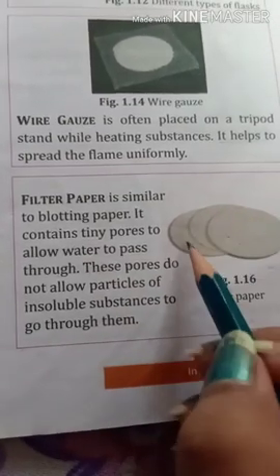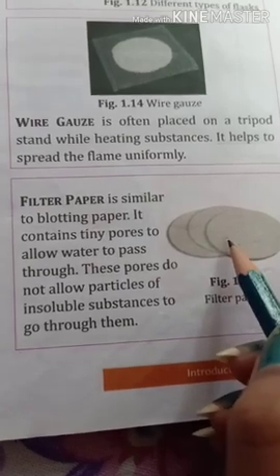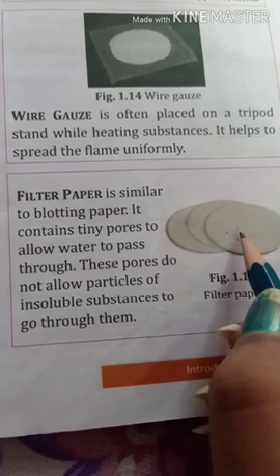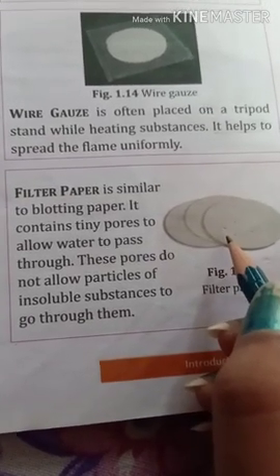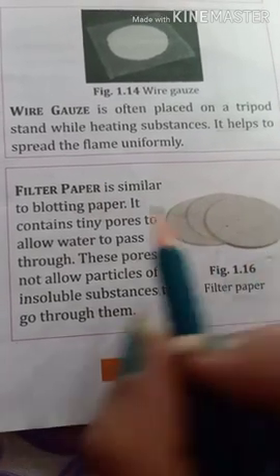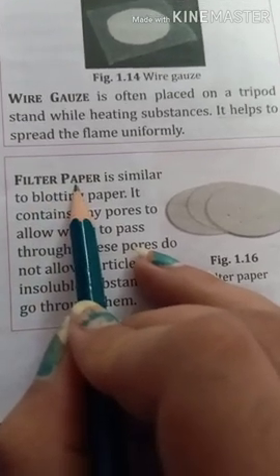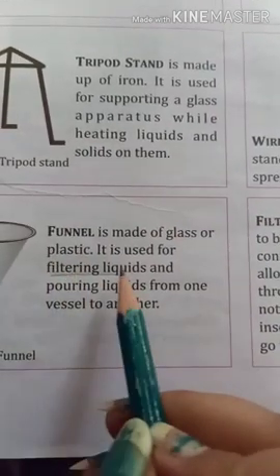So this is filter paper, and in this filter paper we have tiny pores, or tiny holes. These tiny holes allow water to pass through them and do not allow particles of insoluble substances to go through them. That's why this filter paper is used in the filtration process, or for filtering liquids.